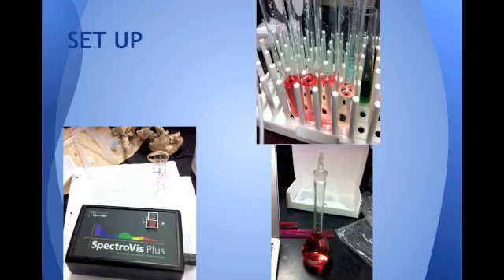But before a plot comparing concentration and absorption can be made, the various dilute solutions had to be made. And this was done by taking a certain volume of cobalt chloride solution with a known amount of aqueous cobalt chloride and mixing it thoroughly with distilled water to create specific dilute solutions.